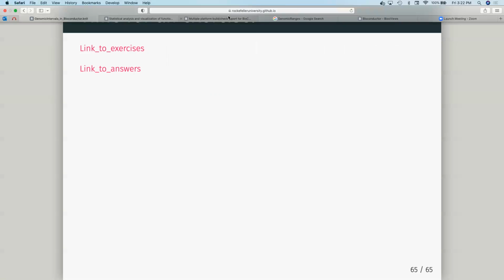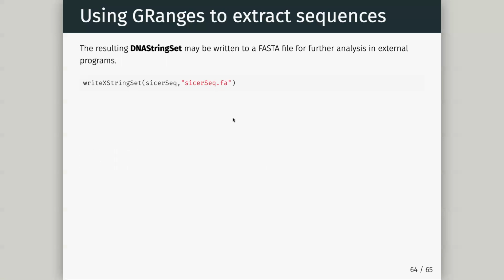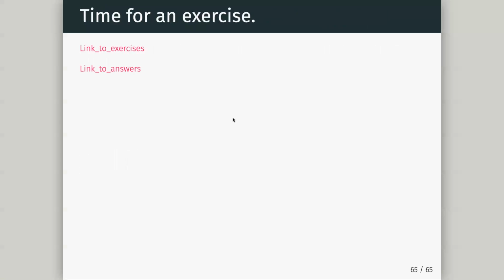Okay, so that's the end of our session today. I know that's actually quite a lot to take in for one session, but I promise you we're going to do that over and over again. All these other objects are built, as you can already see, they all interact with each other. And really we're going to build, say, an alignment as a combination of a GRanges, the sequence, so a BSgenome object, all wrapped up together. So we don't need to learn anything new. We're going to just expand on what we have from this. We're going to see this over and over again.